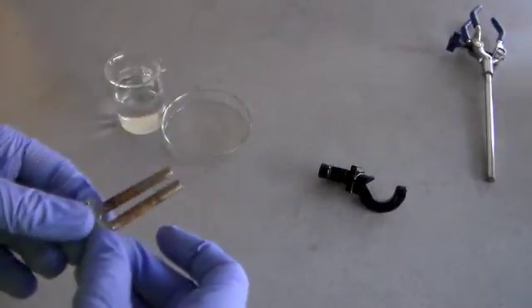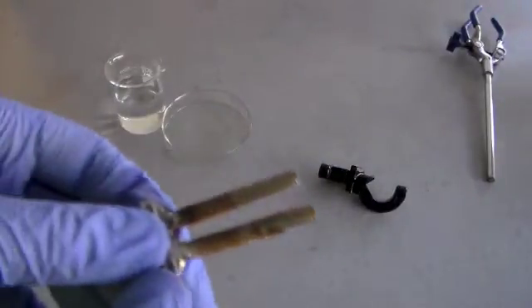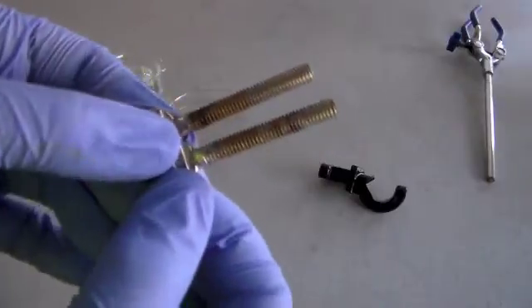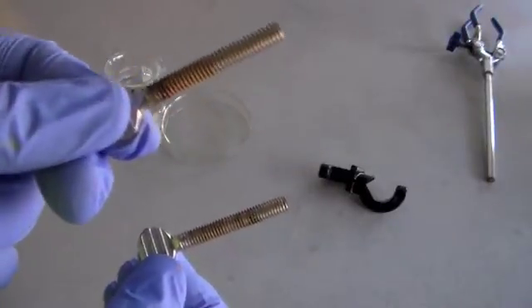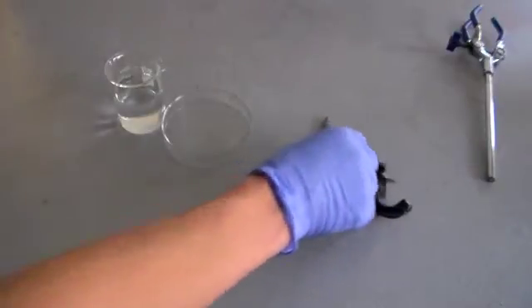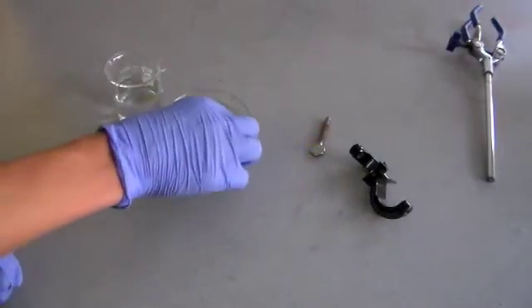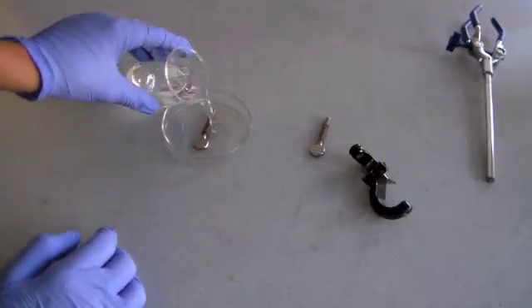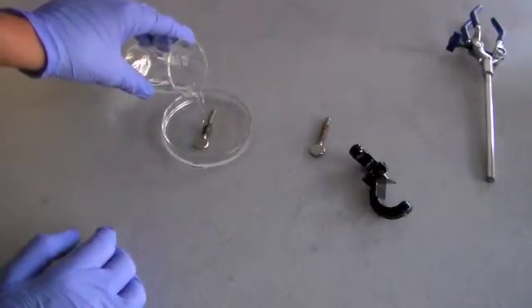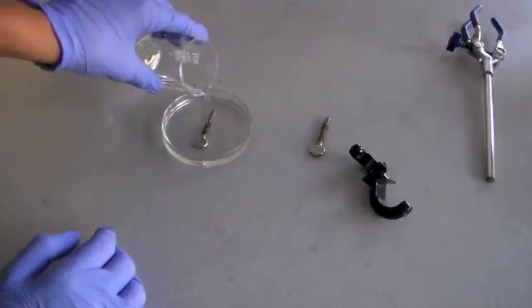So I have two screws. They both have about the same amount of rust. I'm going to submerge this one in the vinegar solution and just leave this one on the table and see what happens. Because I just have a petri dish, I'm going to pour this on and get it fully submerged.